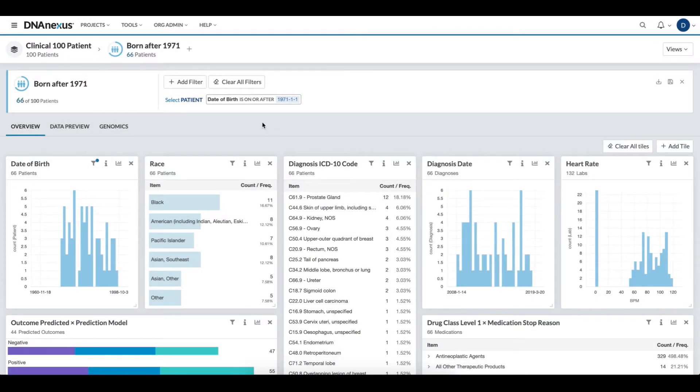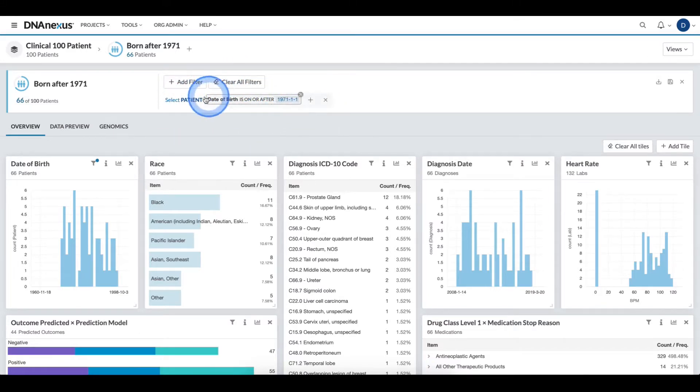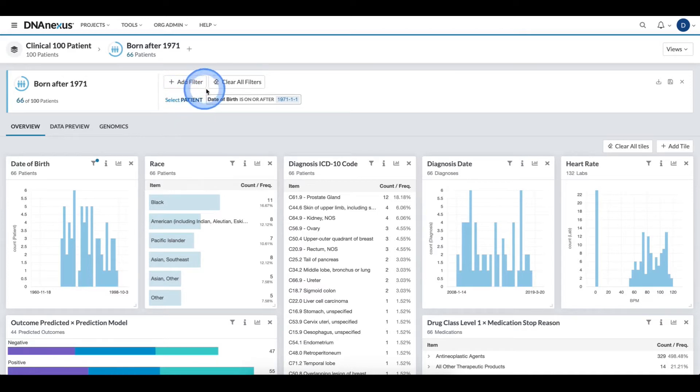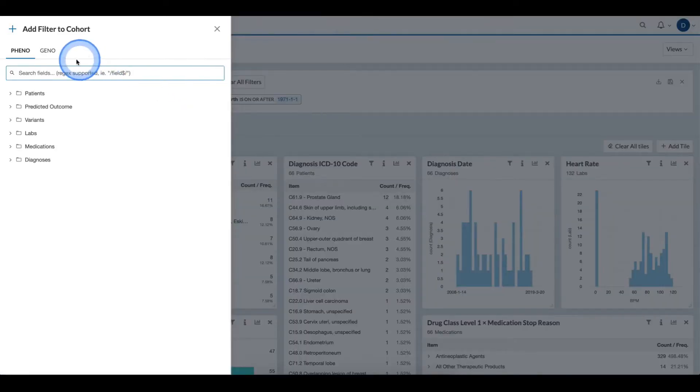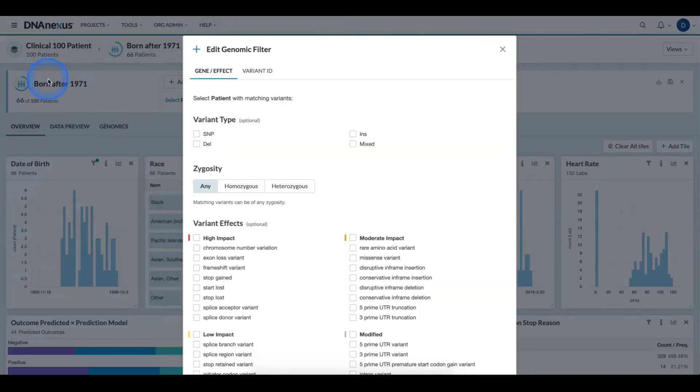For this cohort, I would like to add gene-based criteria alongside the clinical filtering criteria. To do this, I click the Add Filter button, the Geno tab, and then I select the Gene Effect field.